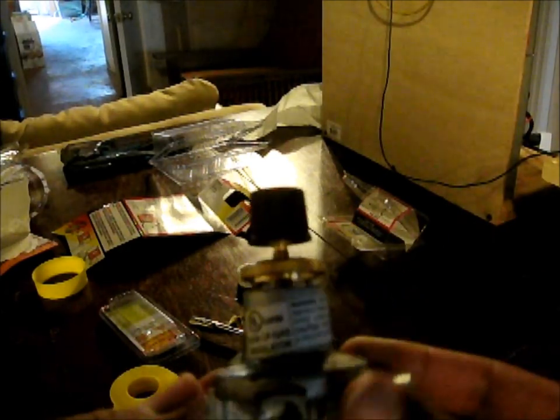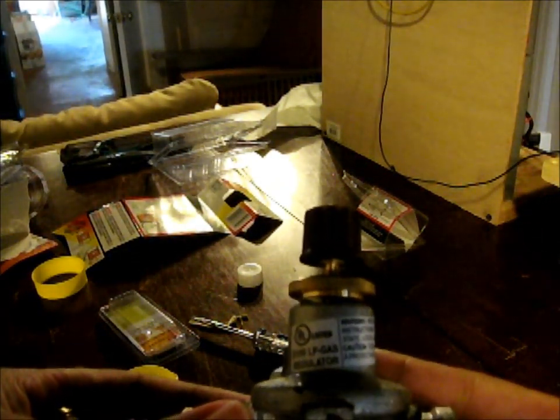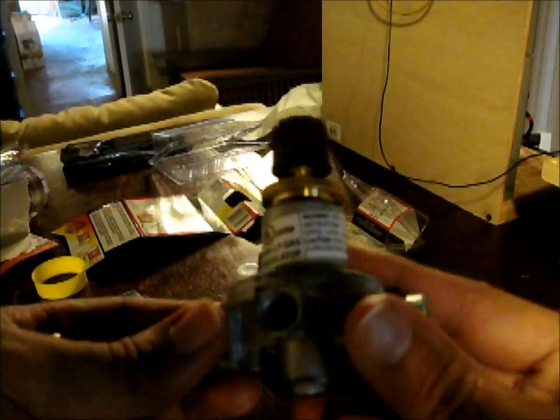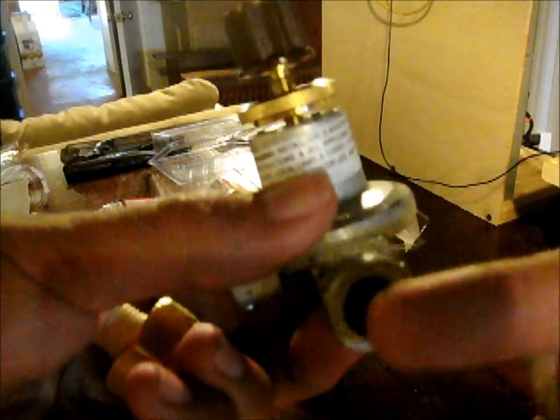A quick note: be sure this knob is fully unscrewed — that means the regulator is closed, so the gas won't just spew out as soon as you hook it up. Also, you might want to put your new fitting in and take it out a few times to clear out some of that Loctite sealant in the threads, because that was creating a major leak for me the first time I assembled this. When you put your Teflon on, leave a thread or so free to thread in, and then put the Teflon behind the first thread or two.